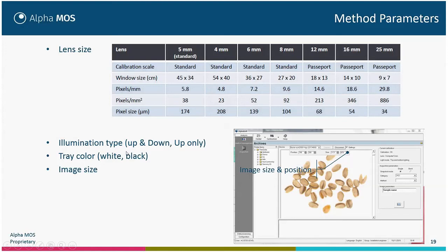For the product, you can also choose the illumination type — it can be up and down, up only, or in some cases down only, but most of the time it will be up and down. You have the possibility to select the tray color. It is white by default, but it can be black. When it's black, you can only use upper illumination because it is not translucent. The last parameter you can select is the size of the image.